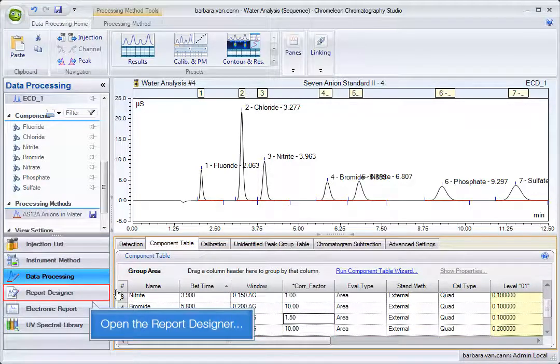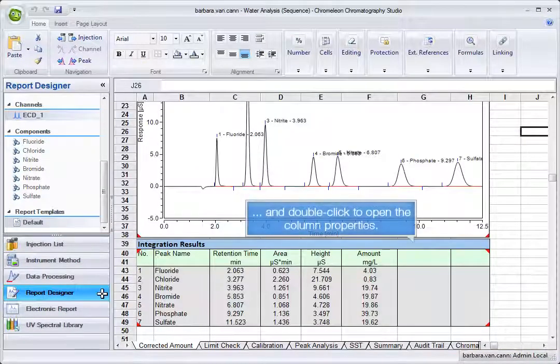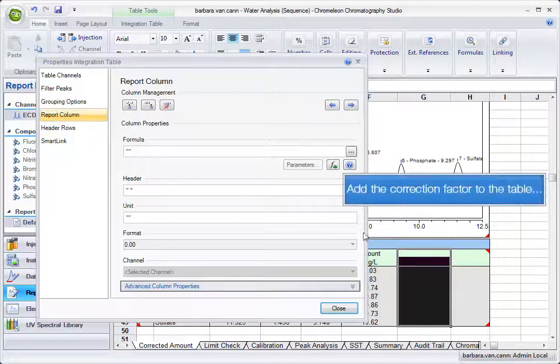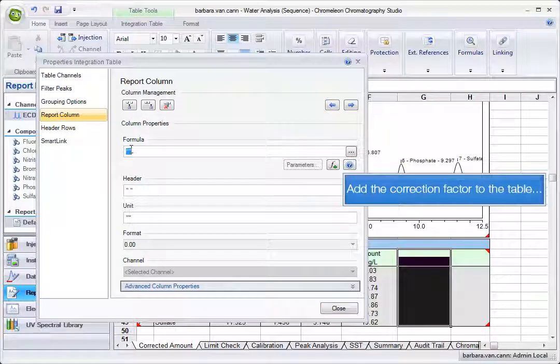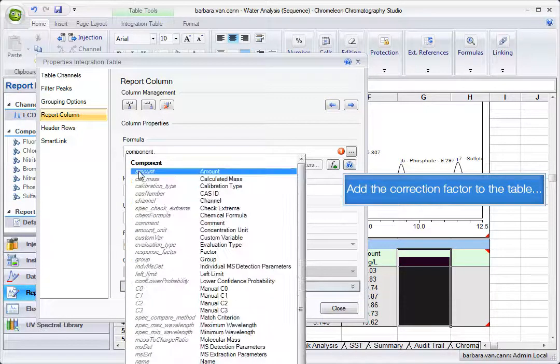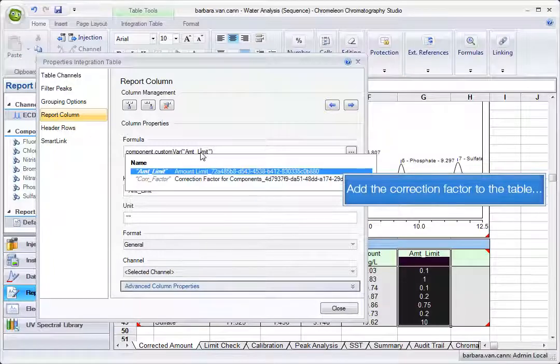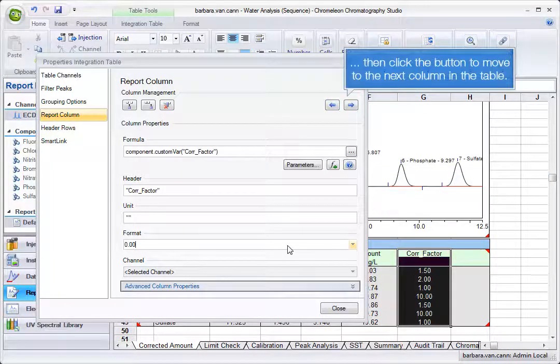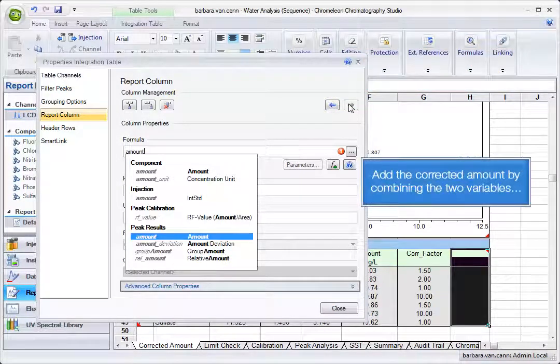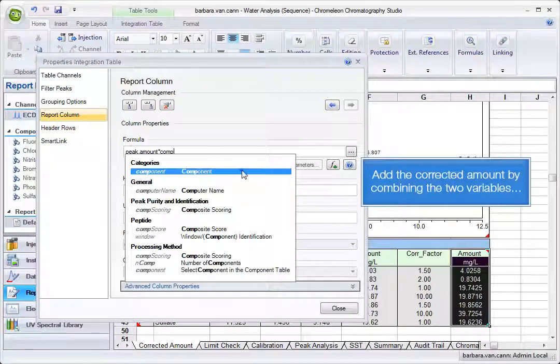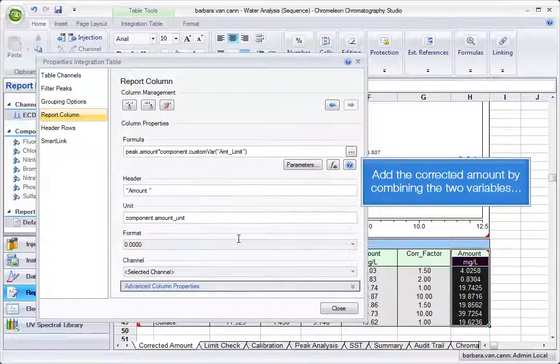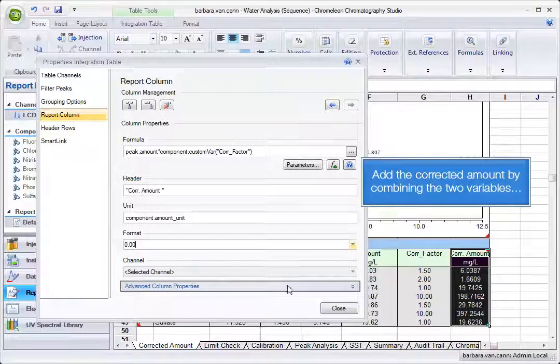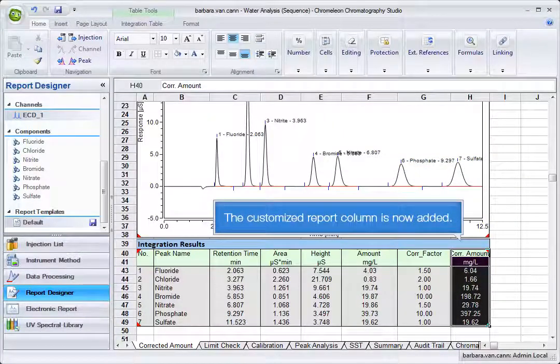Open the report designer and double-click to open the column properties. Add the correction factor to the table. Then click the button to move to the next column in the table. Add the corrected amount by combining the two variables. The customized report column is now added.